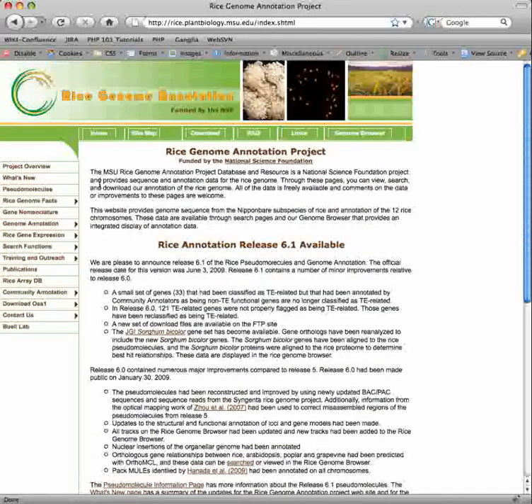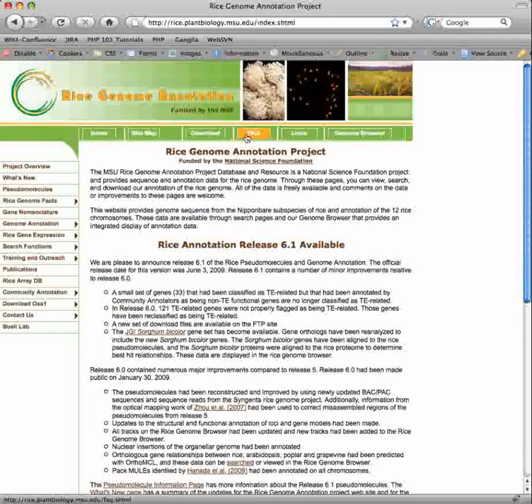Links on the sidebar are provided for more information on the rice genome, annotation, analysis and search tools, and additional information. Links on the top menu bar are provided for downloading, frequently asked questions, links, and our genome browser.